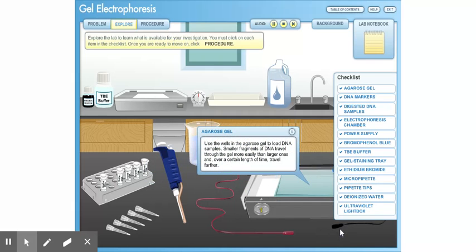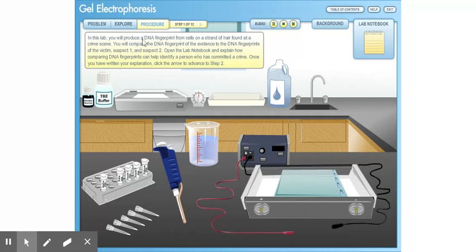Use the wells in the agarose gel to load DNA samples. Smaller fragments of DNA travel through the gel more easily than larger ones and, over a certain length of time, travel farther. In this lab, you will produce a DNA fingerprint from cells on a strand of hair found at a crime scene. You will compare the DNA fingerprint of the evidence to the DNA fingerprints of the victim, Suspect 1 and Suspect 2. Open the lab notebook and explain how comparing DNA fingerprints can help identify a person who has committed a crime. Once you have written your explanation, click the arrow to advance to Step 2.